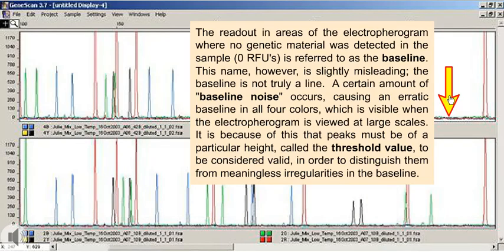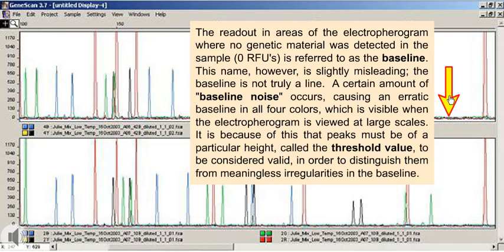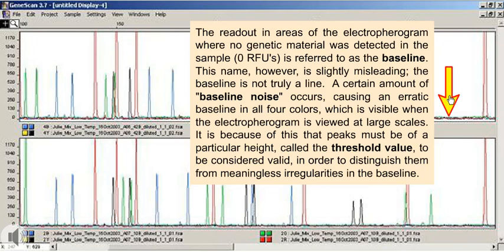The readout in areas of the electropherogram where no genetic material was detected in the sample, zero RFUs, is referred to as the baseline. This name, however, is slightly misleading. The baseline is not truly a line. A certain amount of baseline noise occurs, causing an erratic baseline in all four colors, which is visible when the electropherogram is viewed at large scales. It is because of this that peaks must be of a particular height, called the threshold value, to be considered valid in order to distinguish them from meaningless irregularities in the baseline.